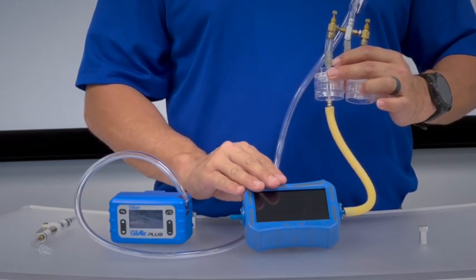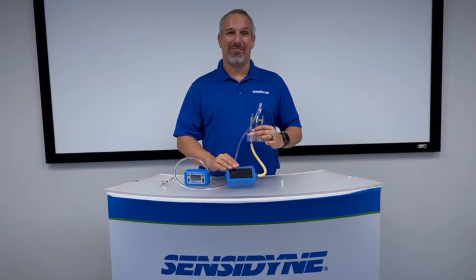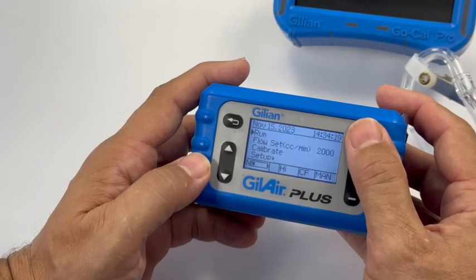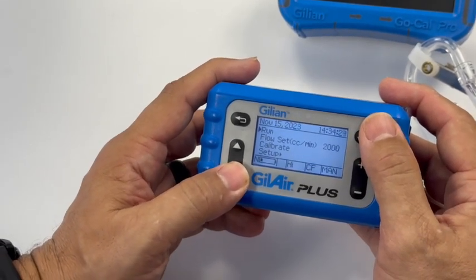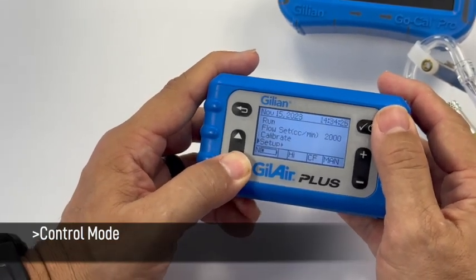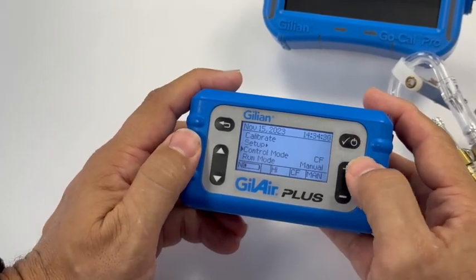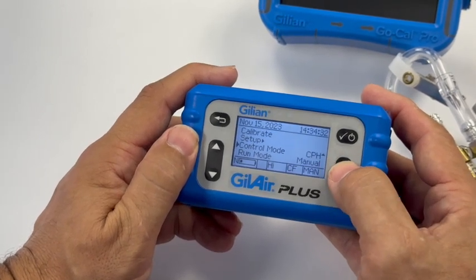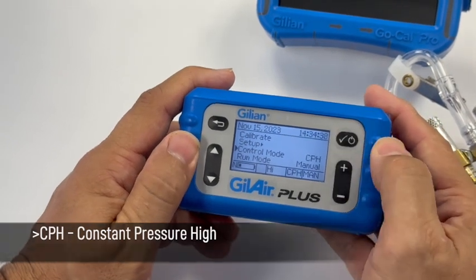Now that I've reviewed the equipment, let's get started with the setup. Power on your Gil-Air Plus. Use the down arrow to scroll the cursor down to control mode. Once on control mode, use the plus key to scroll up to CPH, which stands for constant pressure high. Hit the enter key to save that setting.